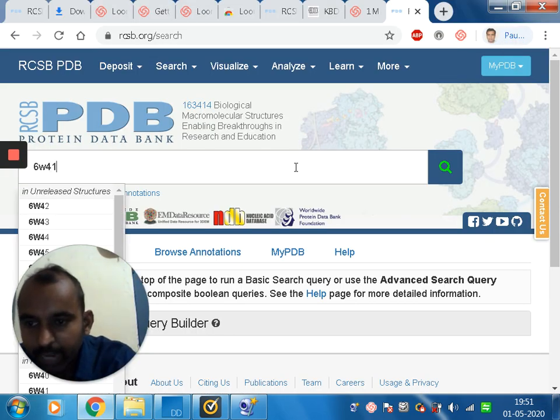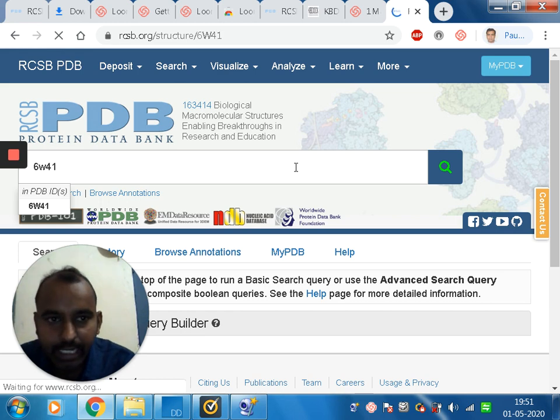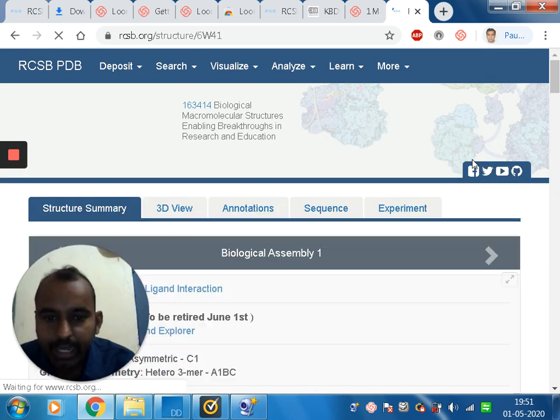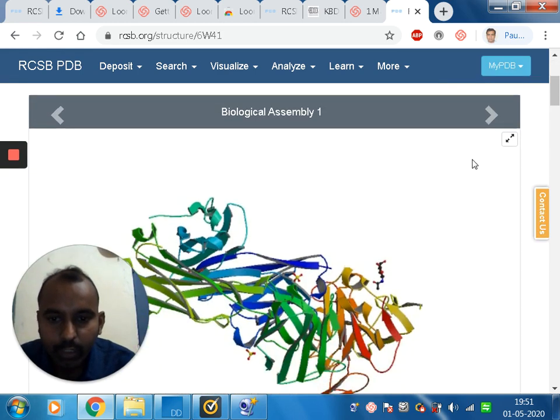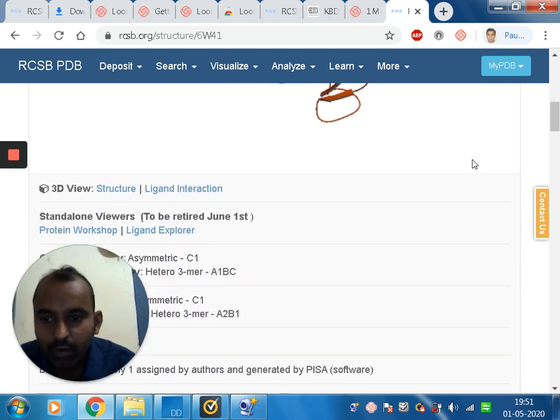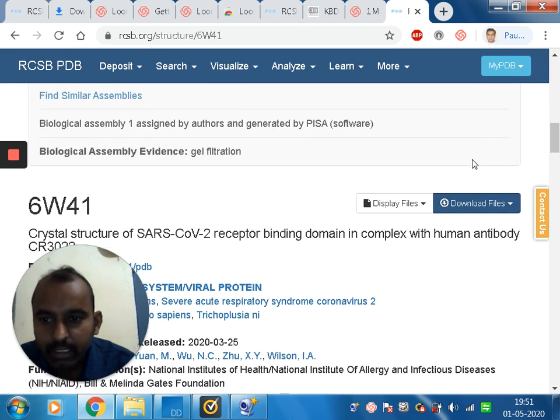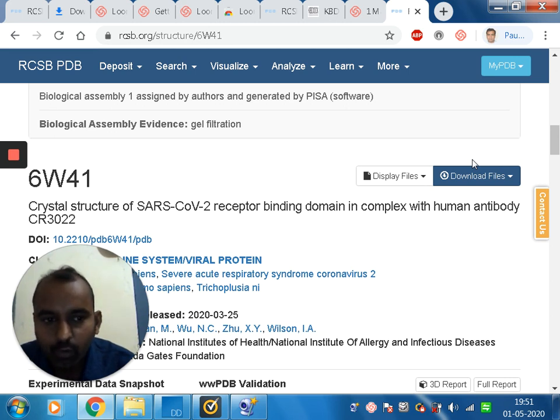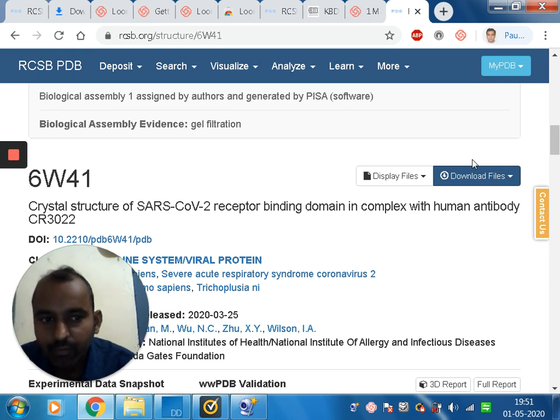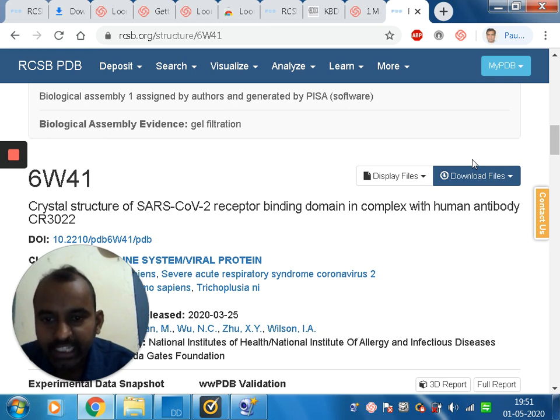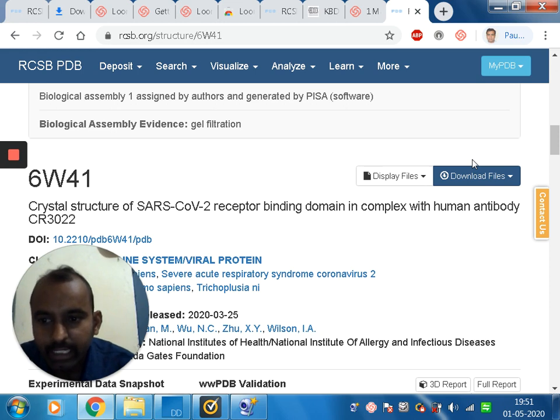The protein of interest is 6W41. Once I type it and click, I get the information for that protein. The protein is the crystal structure of the SARS-CoV-2 receptor binding domain in complex with human antibody CR3022. This is the fundamental information for this crystal structure of proteins bound with human antibodies.